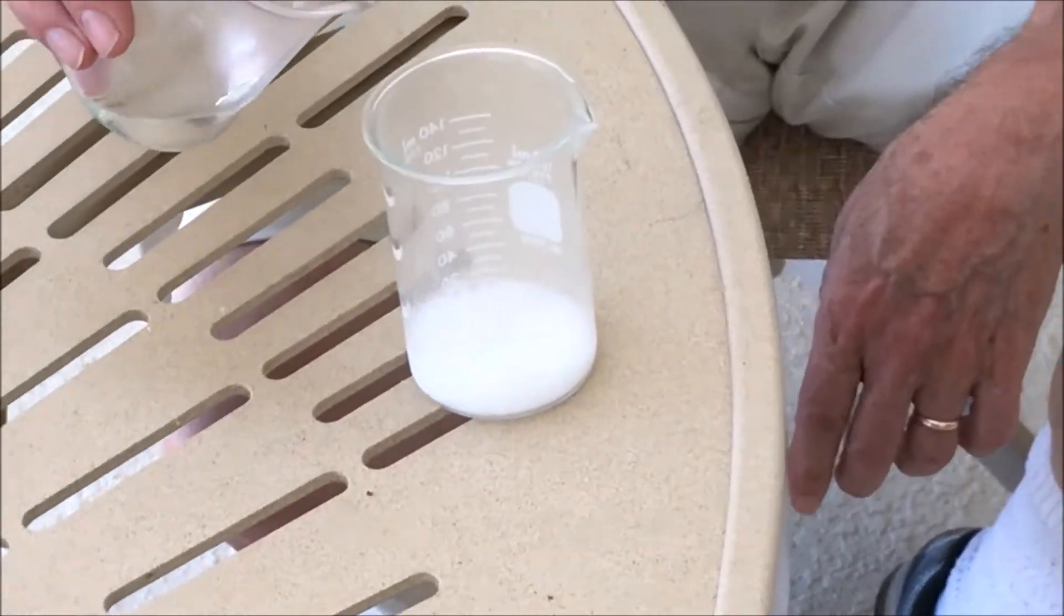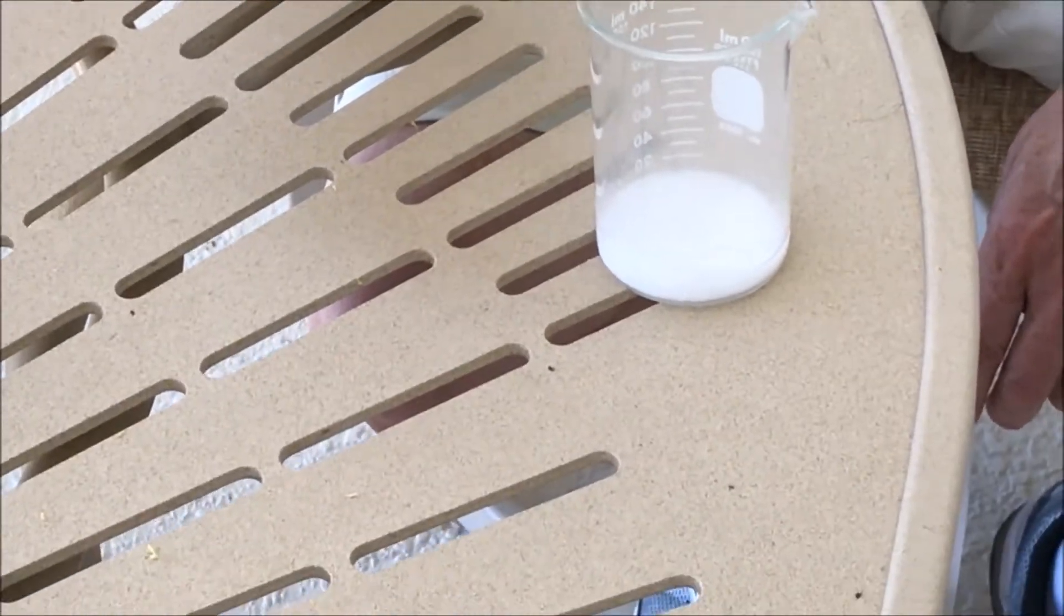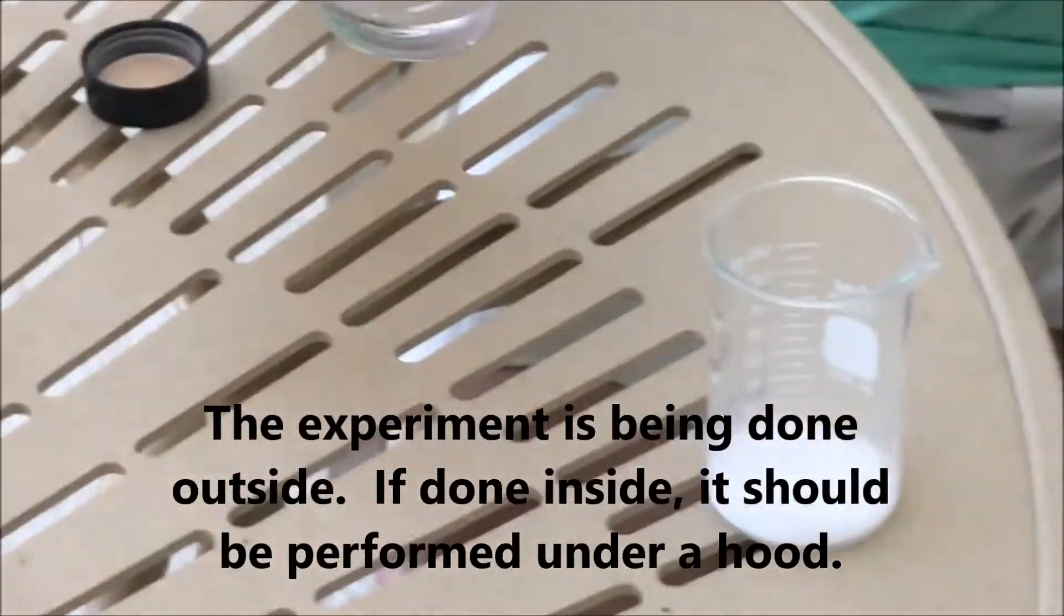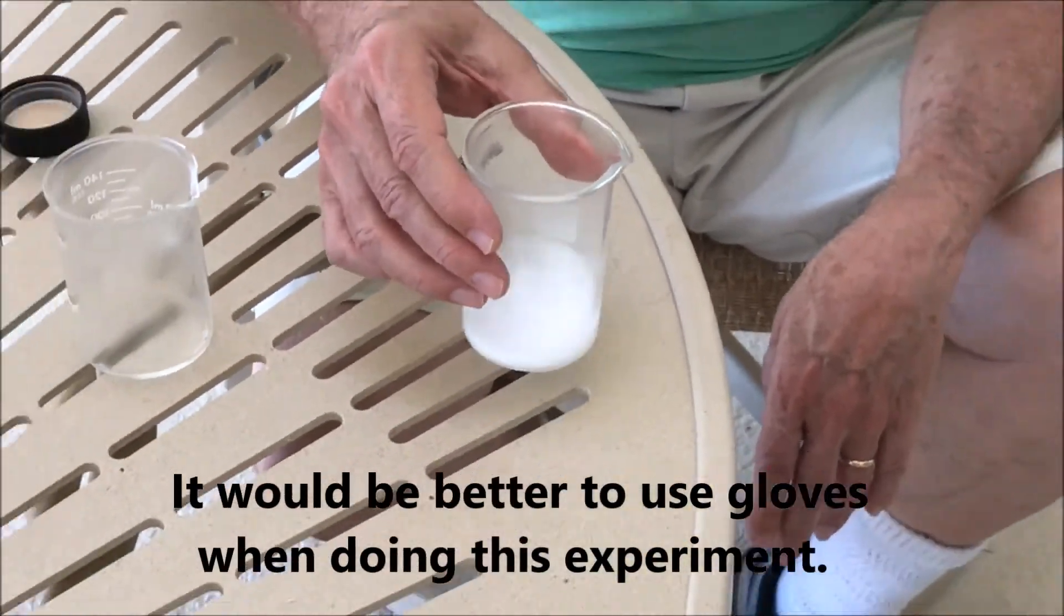As you can see, bubbles are coming off, and that's carbon dioxide. The hydrochloric acid is kind of volatile because it's a gas dissolved in water.